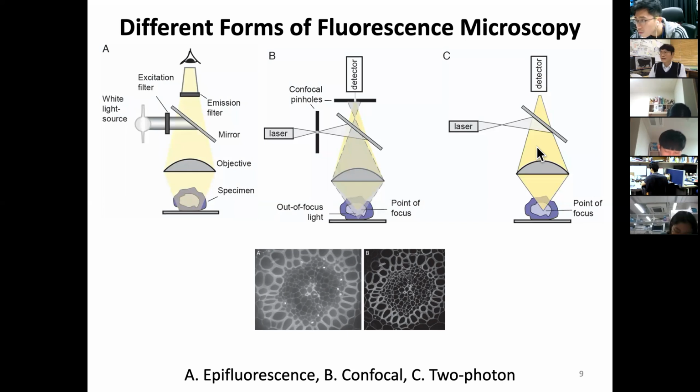For this, I have to explain to you a little bit in detail the imaging process, making an image with a lens. You remember the Dutchman Antoine Leeuwenhoek made the first microscope in history with one lens. What does the lens do? Lens is just bending light, that's all, but in a careful way.